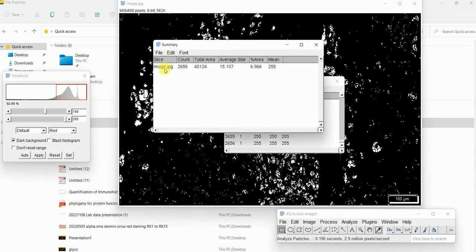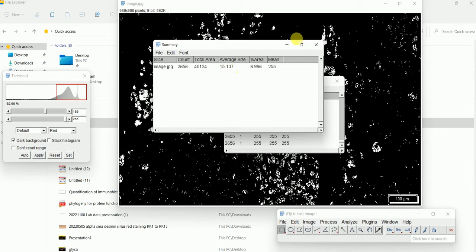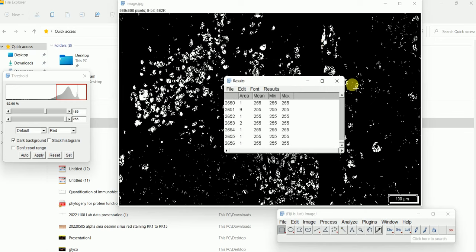Now you can see that the total number of particles counted is 2656. This shows the total area, the percentage of area, the average size of each particle, and the mean particle size. This is how you count the total number of cells from your positively stained sections.